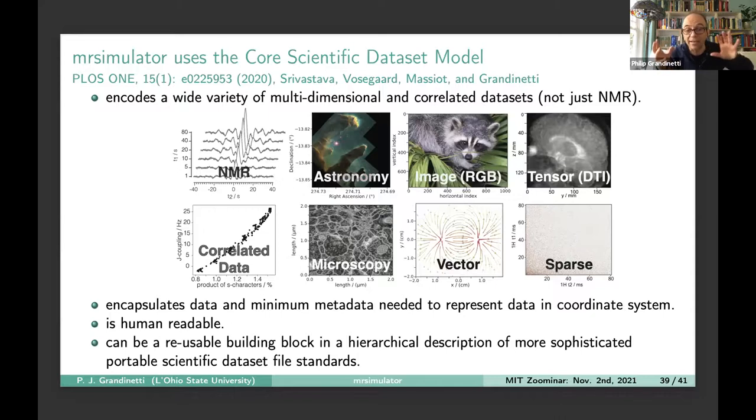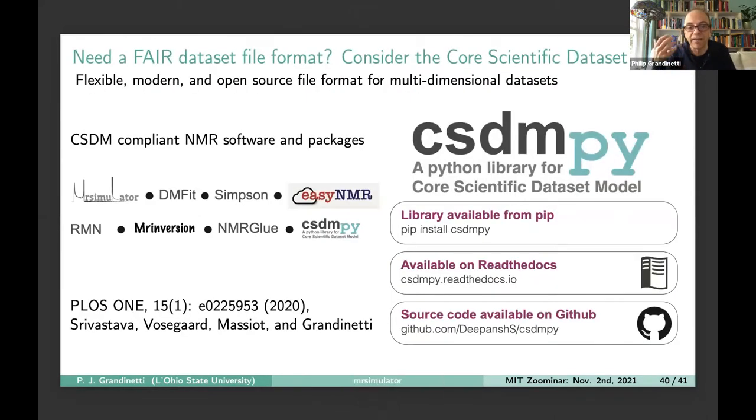And that's what's great, is that you can then bring all those data sets together in one common format and be able to view them all together without having to have translators for the different file formats. So that has been developed by that team.